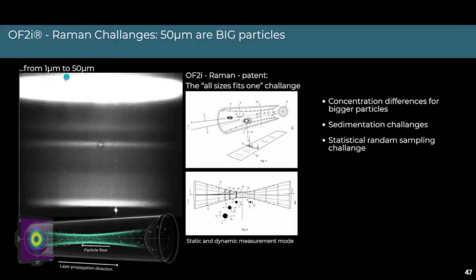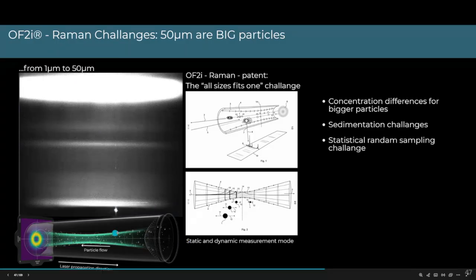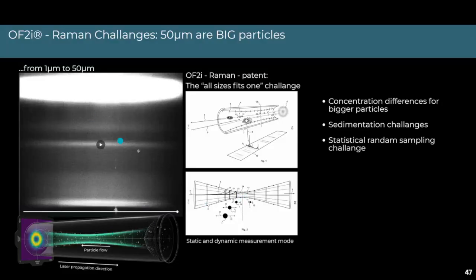There, we face some challenges because when the particles flow through, we need a high scanning speed. So we push lots of volume through to get statistically valid data. But on the other hand, you also want particles available for a longer time while they flow through, to get the information. When a big, huge particle comes, it stops, it's really trapped. The smaller ones do exactly what they should do. They come, they are trapped, they flow through, we collect their data, and they flow out again.